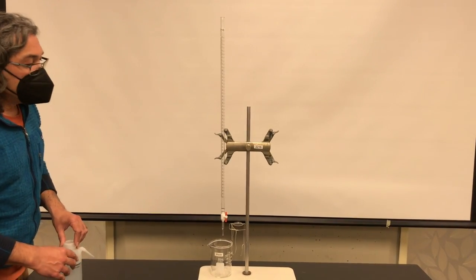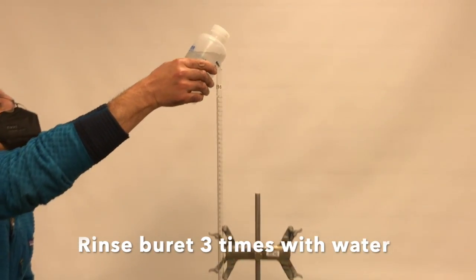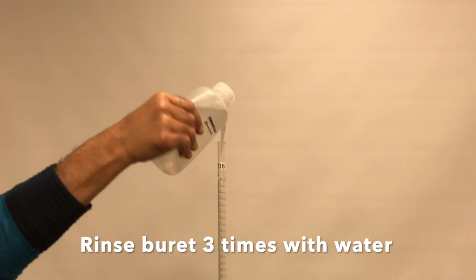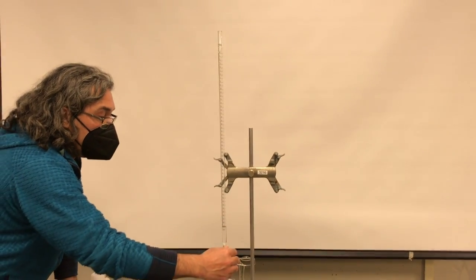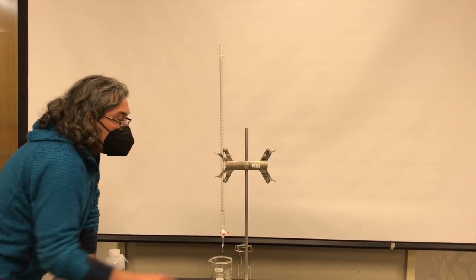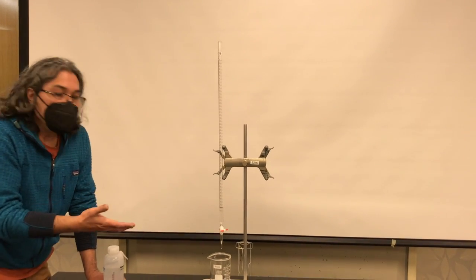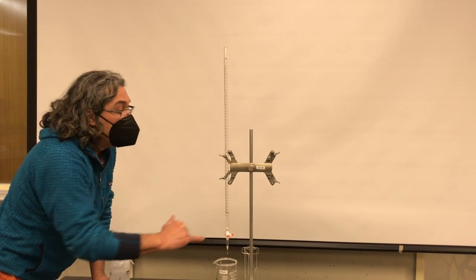To rinse the burette, I like to start with the valve open, and then I just squirt a small volume of the water into the burette, and I'm using a circular motion to try to make sure that I rinse all of the surface and the inside wall. Once I get a little bit of flow, then I close the valve. The reason why I start with the valve open is because it makes it less likely that air will get stuck on the tip of the burette and the valve.